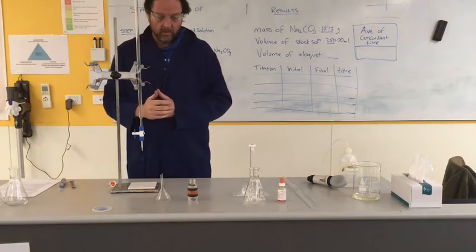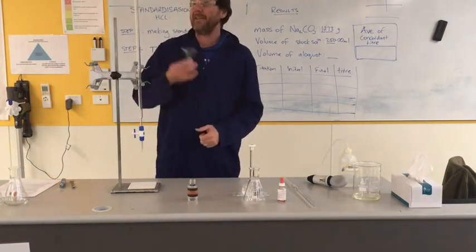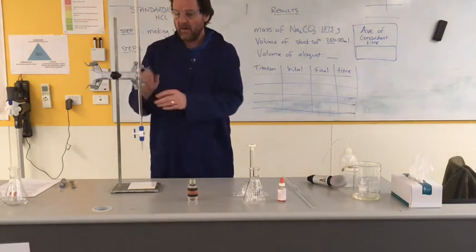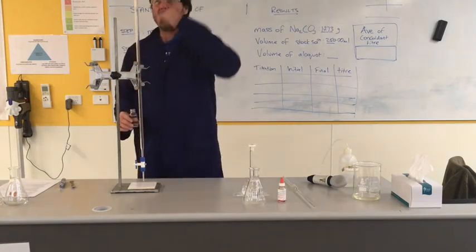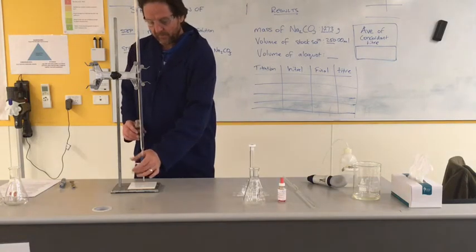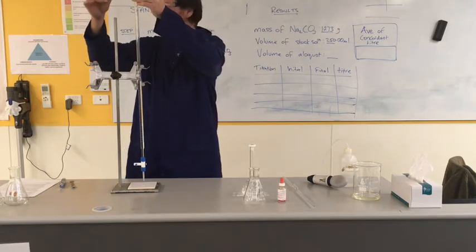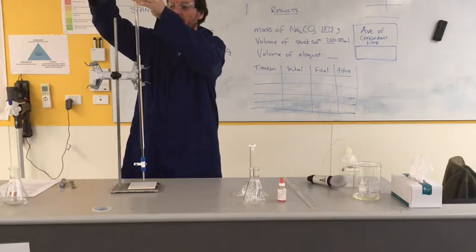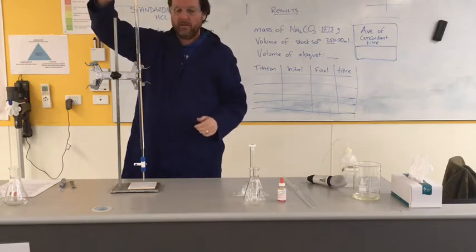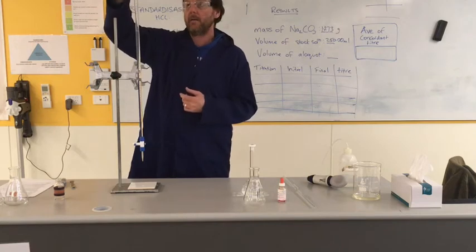Now I can fill it up with the HCl. Please remember you don't want to be pouring stuff above your eye level, especially an acid. If you are concerned, you can always remove it from the desk - but I feel that's okay for me, it's not above my eye level. So I'm going to make sure the tap is off and pour some in. Hopefully it's around about the 10 ml mark - it's pretty close to the 10 ml. That'll do us. I don't need to measure yet. Remember to take the funnel out.